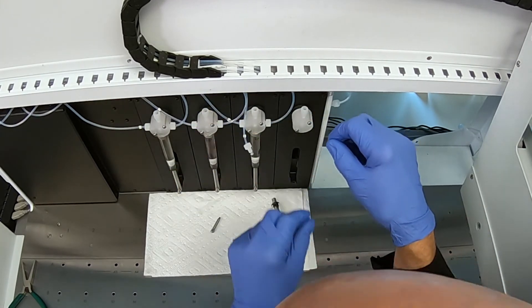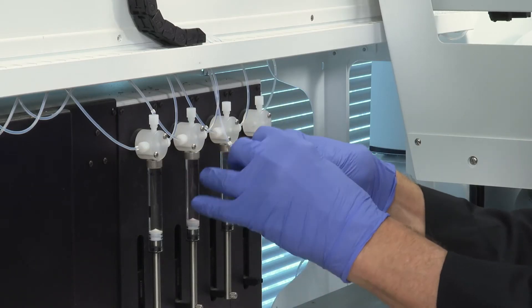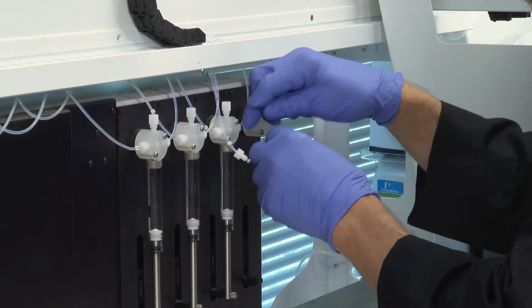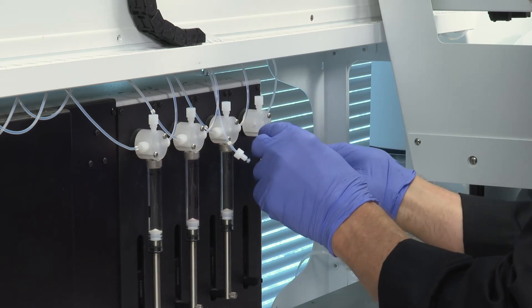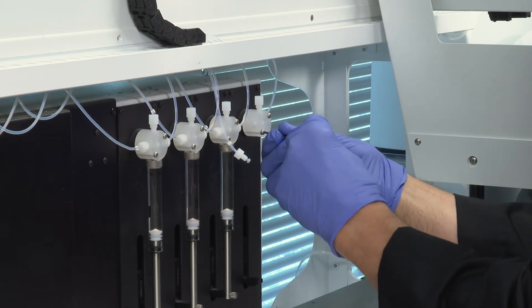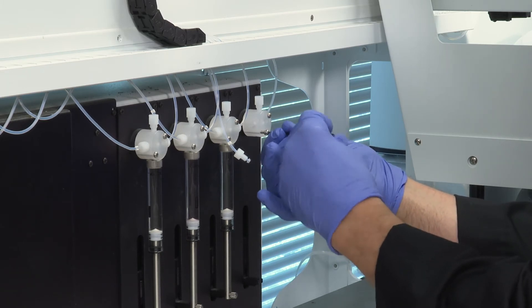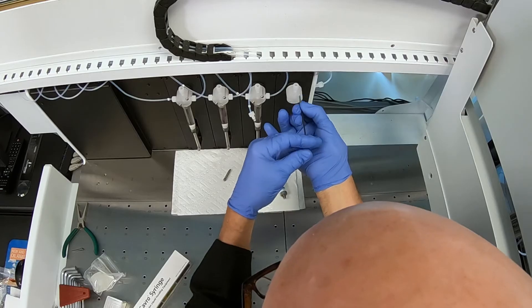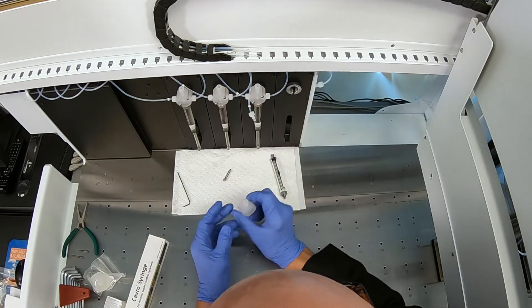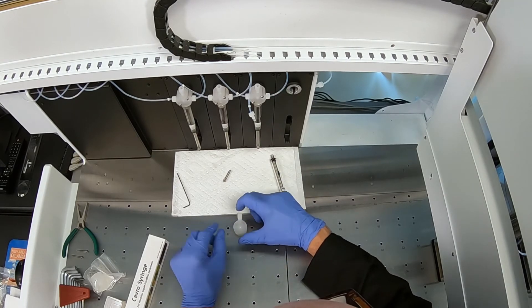Use an Imperial Standard set of Allen keys and remove the screws from the face of the four-port valve. All screws on the Oil Express instrument should be Imperial Standard, with the exception of any motors, which are usually metric. Remove the old four-port valve by pulling it straight out and leave it in its orientation with the plug still intact.